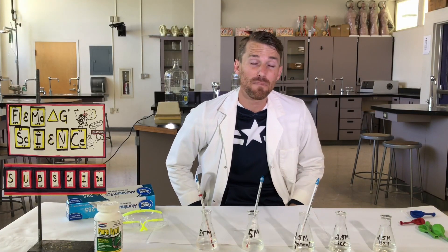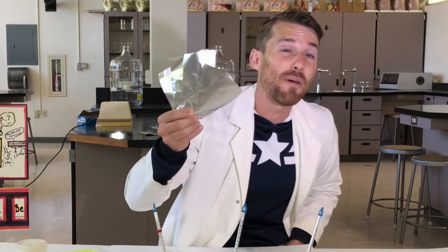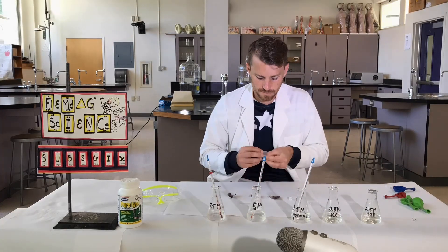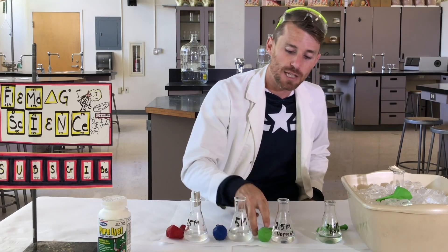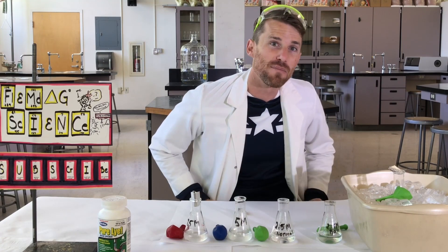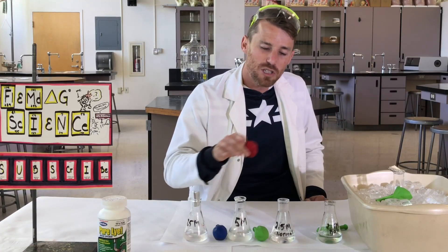Now I need to cut five half-gram pieces of aluminum. I'm going to be using regular aluminum foil and I'll weigh those out right now. I got my five pieces of half-gram aluminum. Let me fold them so they fit inside our flasks. The aluminum has been folded into equal-sized pieces. One piece goes into each flask. On top of each flask we're going to put a color-coded balloon. On the 2.5 molar flask we'll put green balloons. One 2.5 molar flask will have a reduced surface area aluminum ball. Another 2.5 molar flask will be surrounded by ice. How fast the balloon fills up with gas will dictate how fast the reaction is taking place, so make your hypothesis about which flask fills up the fastest.